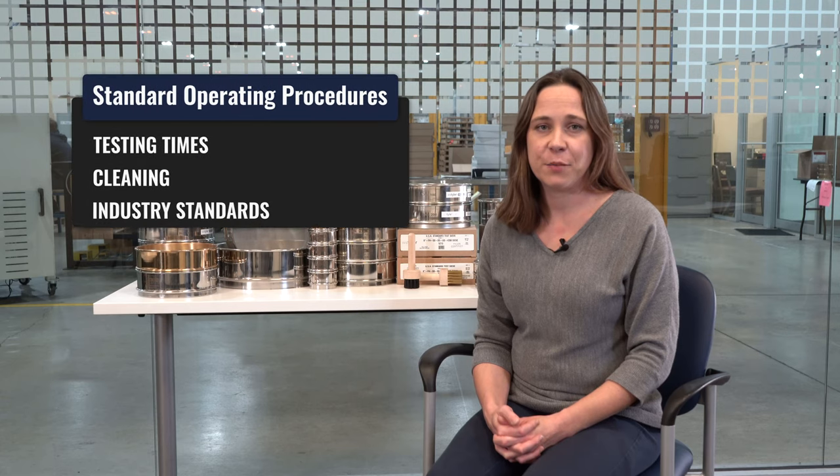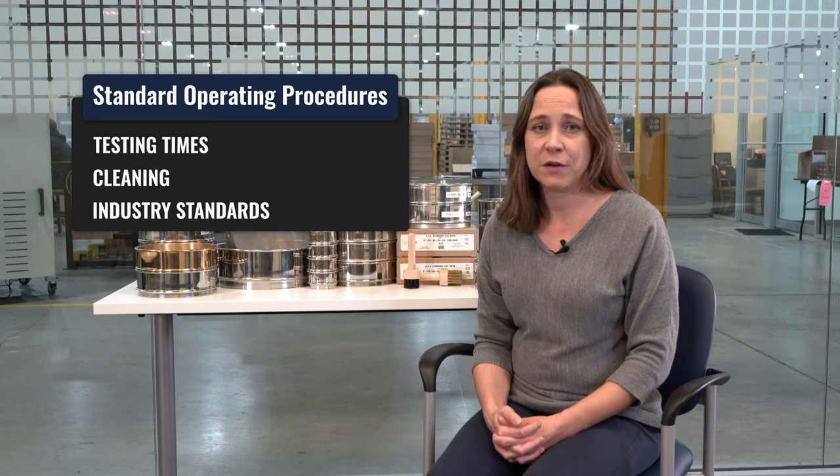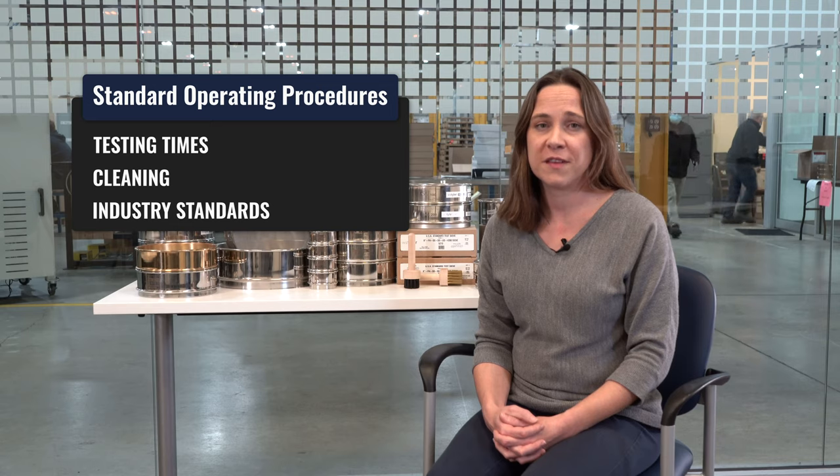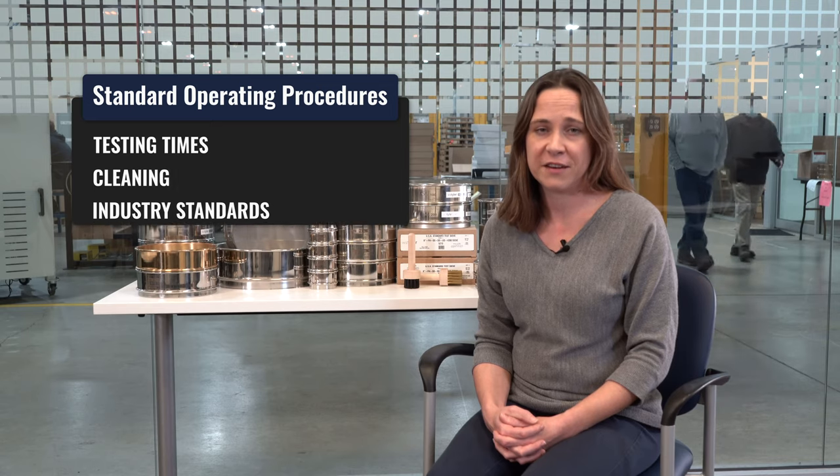Are you following the standard operating procedures for your laboratory, including testing times and how you're cleaning your sieves? And if there's an industry standard for your material — something in the ASTM or ISO standards — are you following those steps to make sure that you're performing to that industry standard?